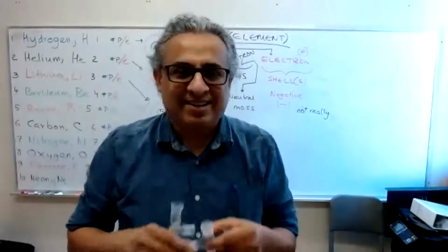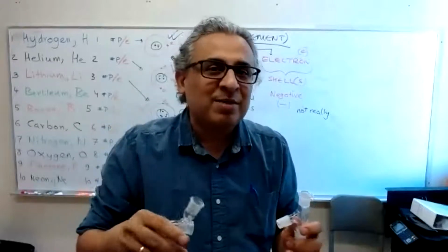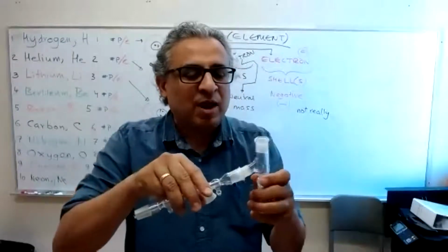Distillation head. I'm not going to teach you all the names right now, but you need to memorize them. If you don't memorize them, and if you see it in quiz number 1, it's an easy point, low-hanging fruit. Do not miss those low-hanging fruits.